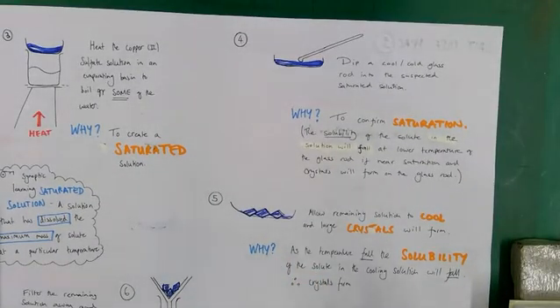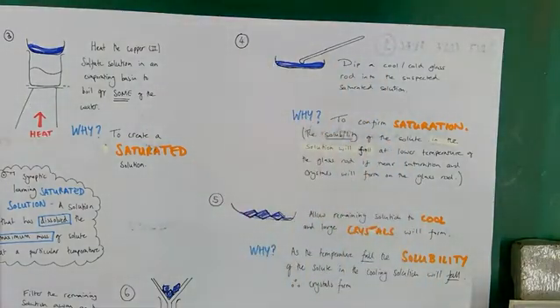How do we know we've reached saturation? Stage four: dip a cool glass rod into the solution. The cold rod lowers the solubility at the point of contact, and crystals should form directly on the rod, proving we're at saturation.